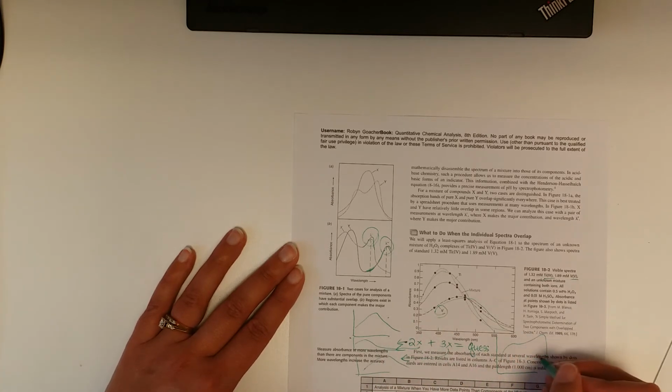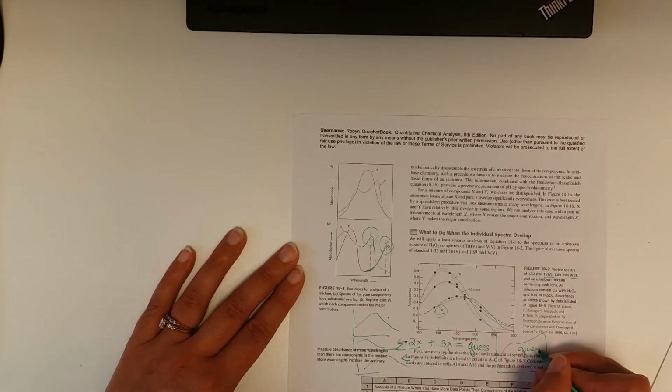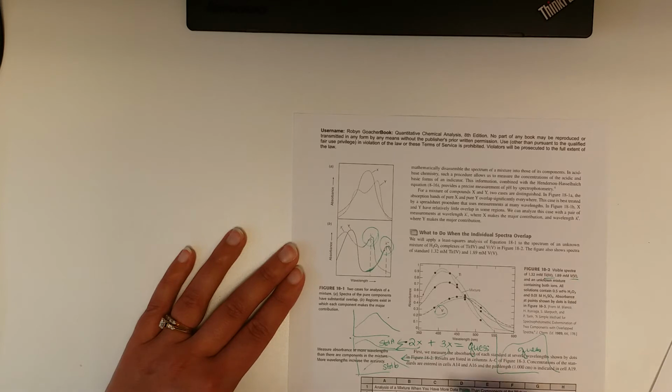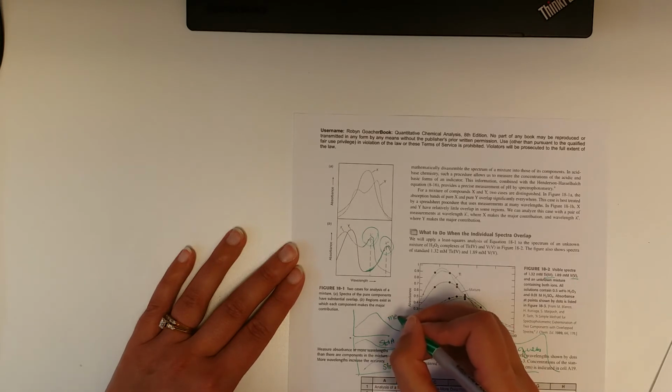Then you compare this guess, which is comprised of some portion of a known, so this is standard A, and some portion of another known, standard B. Because we're adding up with Beer's law, we can do this. And this is our actually measured sample.